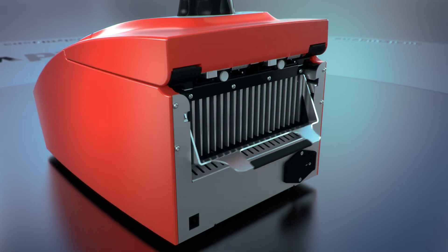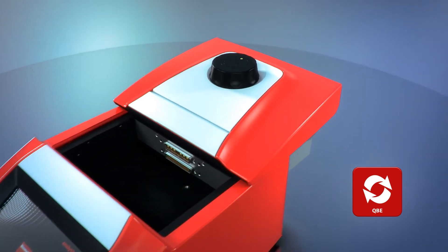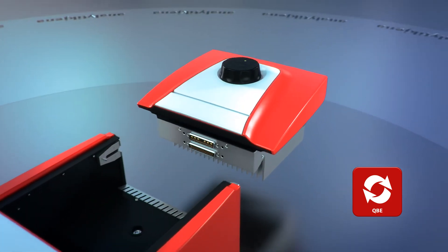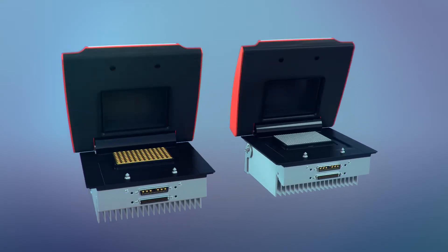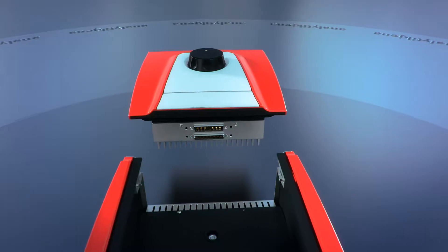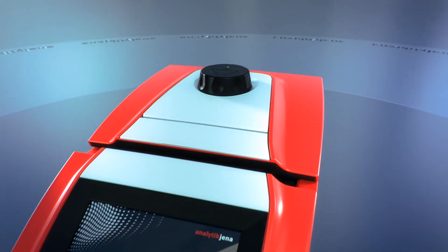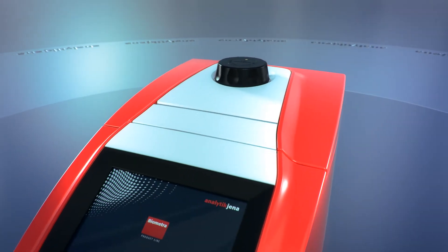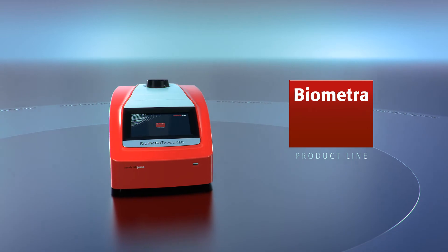By quick block exchange technology, sample blocks can be exchanged in few seconds. Four different sample blocks with or without gradient option are available. Exchange sample blocks become automatically installed by the software.